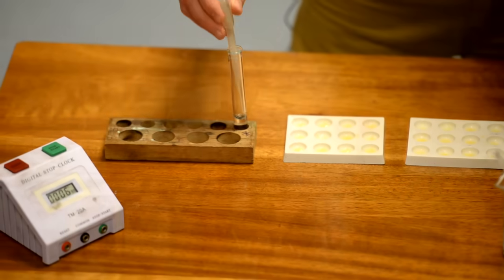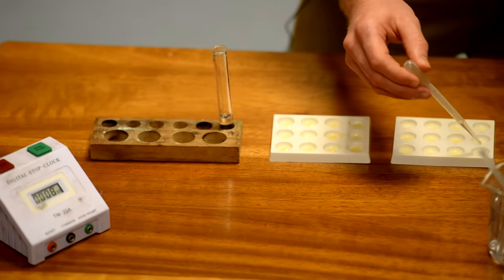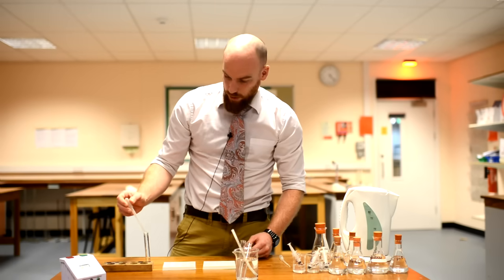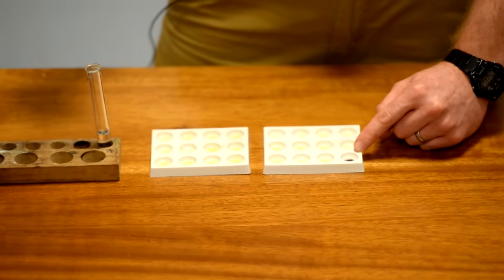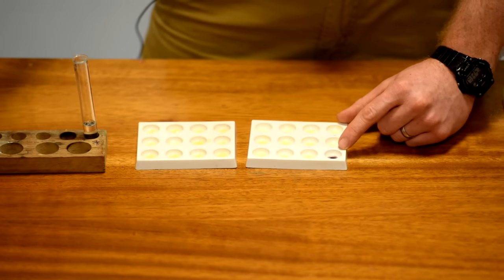You'll also need to take a zero reading immediately. This will show a black colour change indicating the presence of starch.